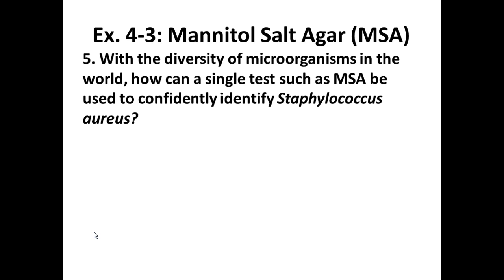So, who thinks they have Staphylococcus aureus as their unknown? Look at your mannitol salt plate. Do you have growth? Do you have a yellow color to your media? Nobody? Yeah, because guess what, I think the person who has it is the one who's been absent, who maybe is not coming back, although I don't know. Okay, I need to check in with her. But some of you had growth, right? So, do you have staph?